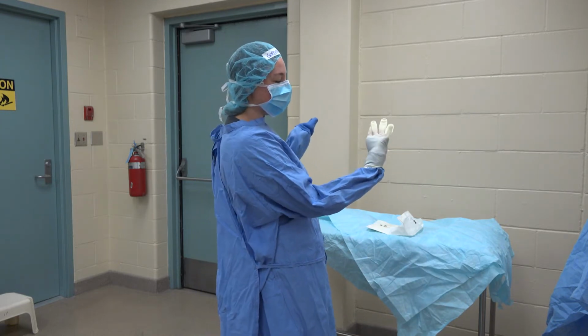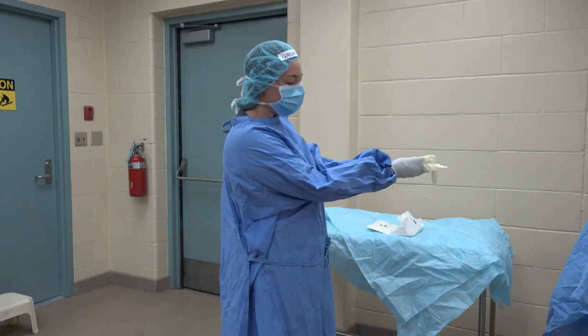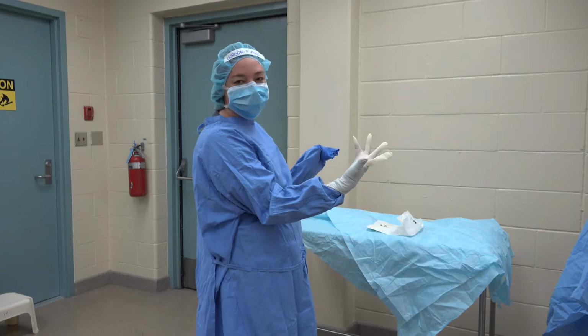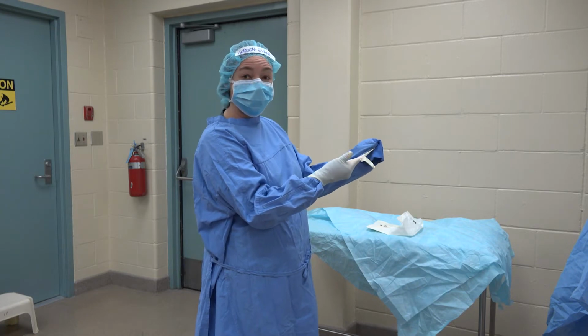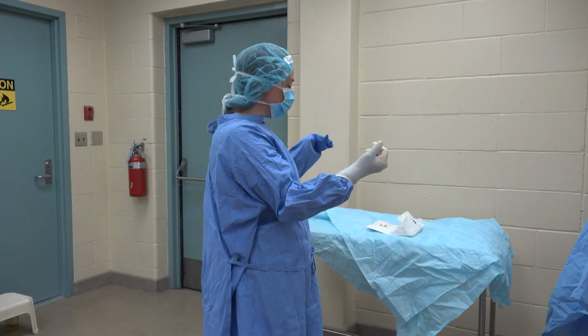Now, my thumb's not out of my sleeve in there. I don't know how well you can see that, but it's still covered up by my sleeve. So what I'm going to do is pull on my sleeve to pull it up. And crap, now I got my fingers all in the wrong holes. All I got to do is, again, taking my sleeve on this hand, because it's sterile, I can do this. And I can pull on my glove, resituate my fingers, and voila, one hand done.